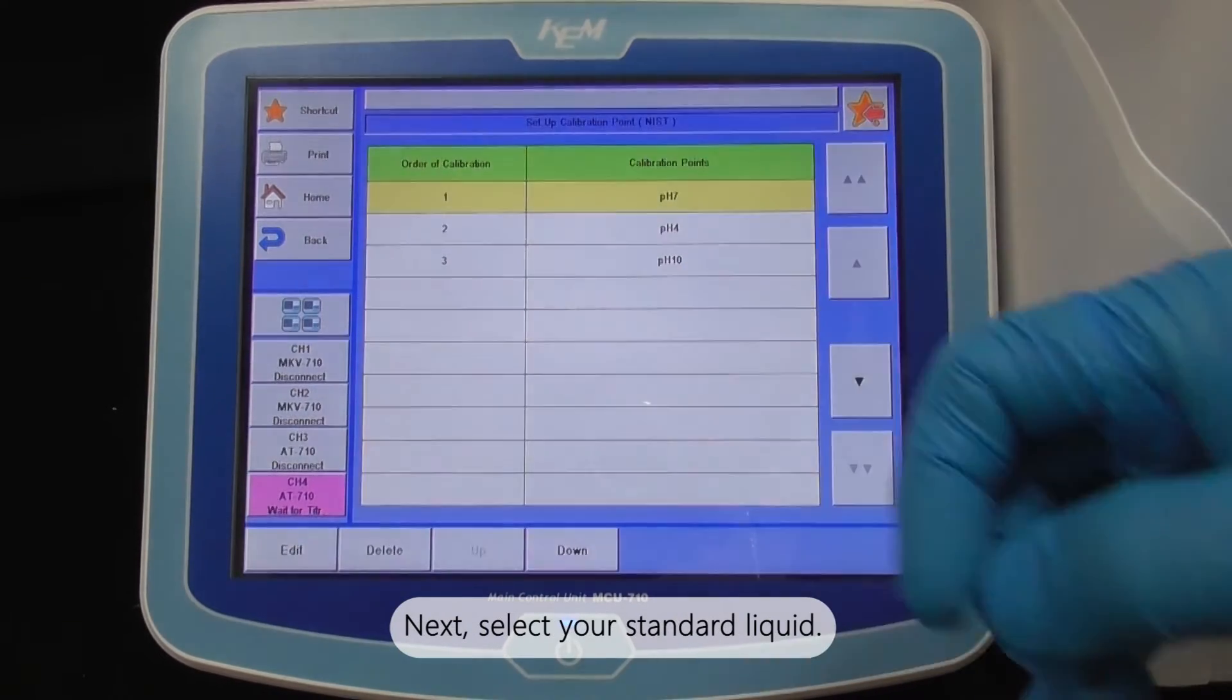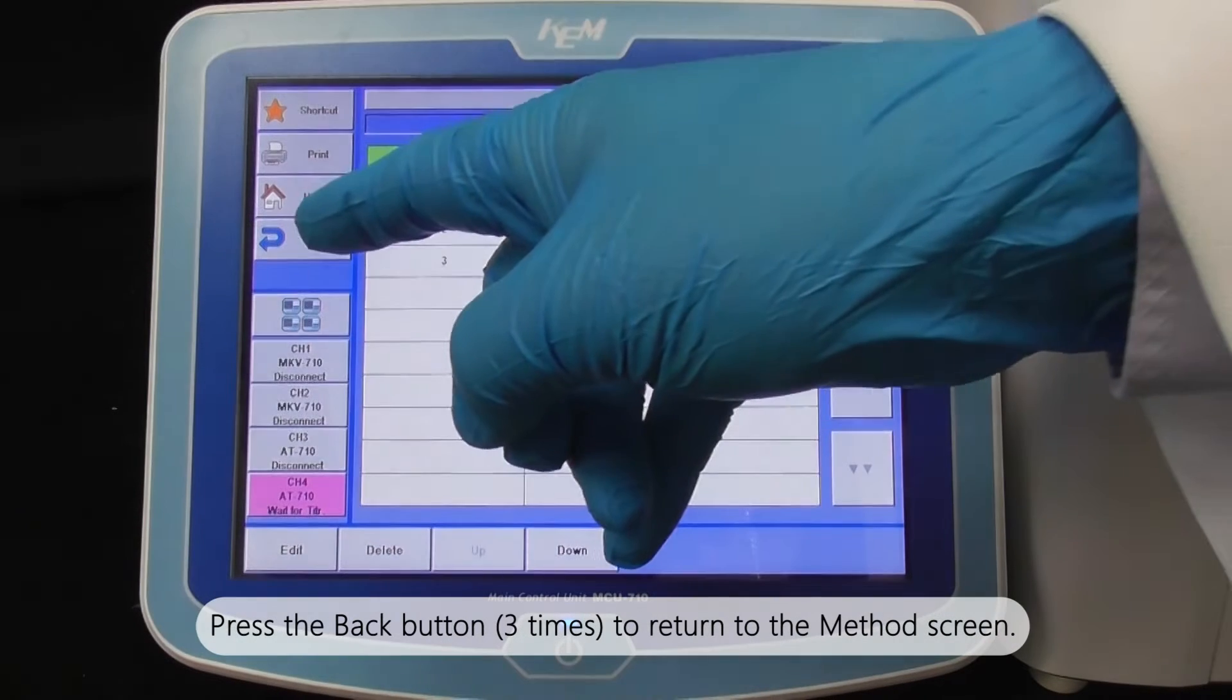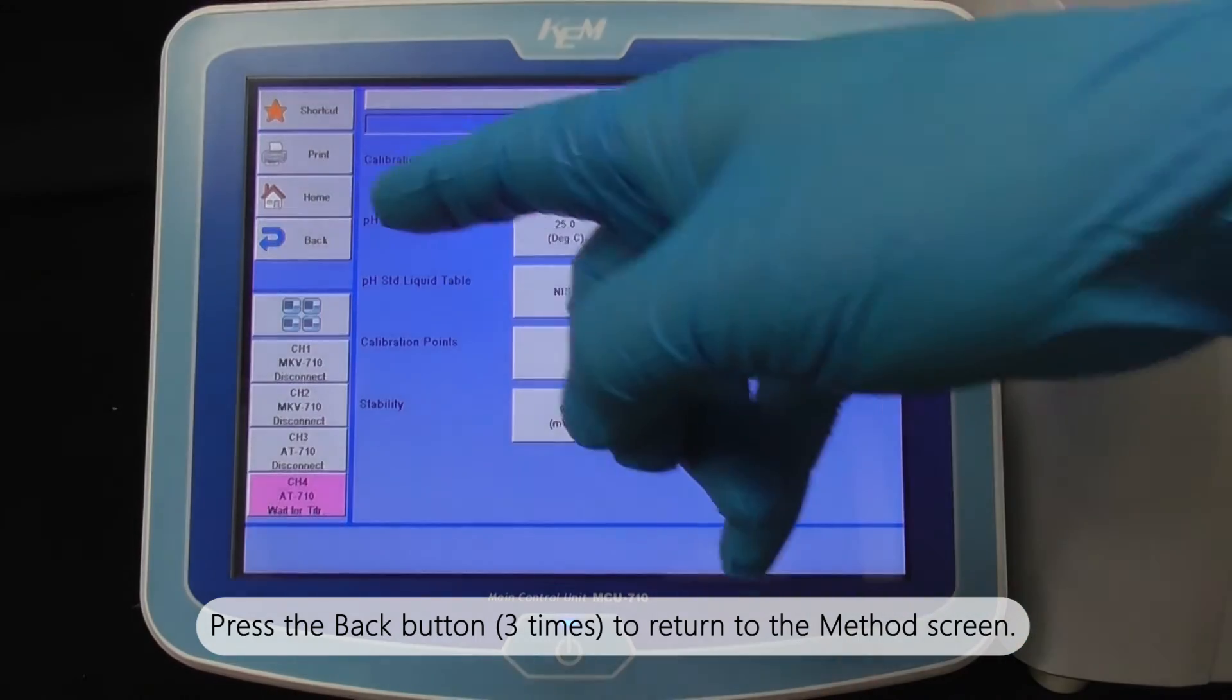Next, select your standard liquid. Here, three types including pH 7, 4 and 10 will be used. Press the back button to return to the method screen.